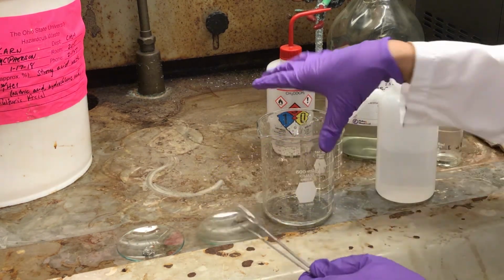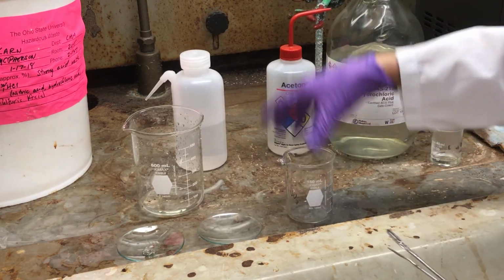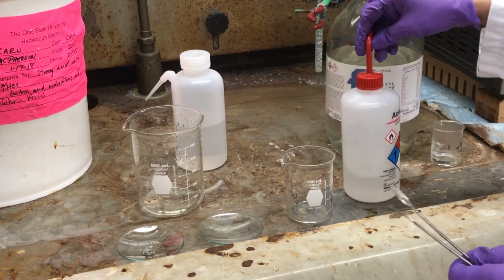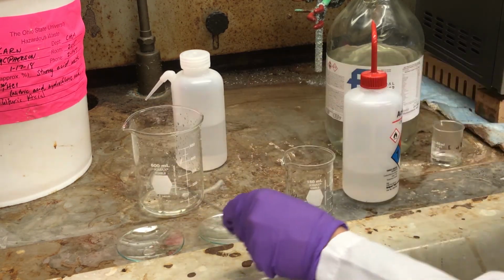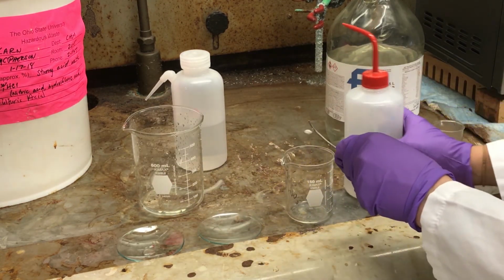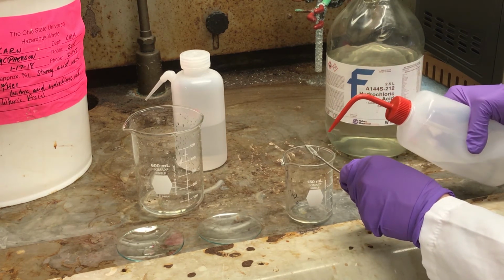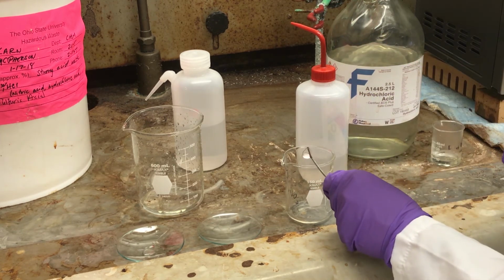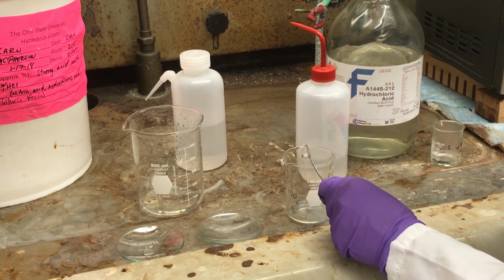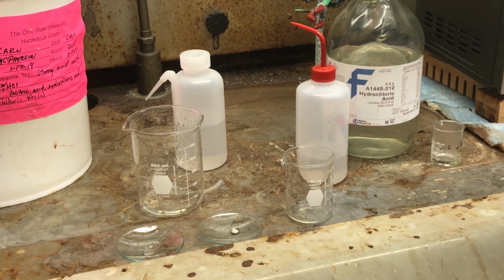So the next thing we're going to do is rinse off the platinum pan with some acetone. I really only need one of these. Okay. So we're going to rinse off with acetone. And basically this just aids in drying. Notice that I'm collecting the acetone in a separate container. This is going to go in the proper organic waste container.